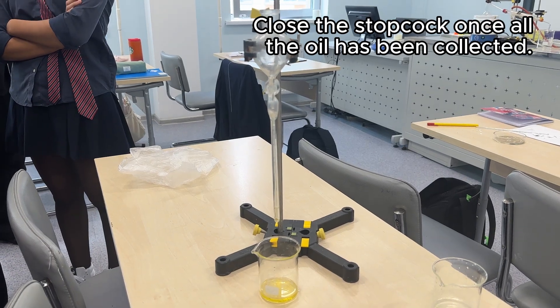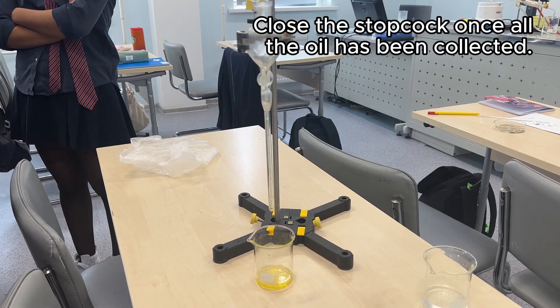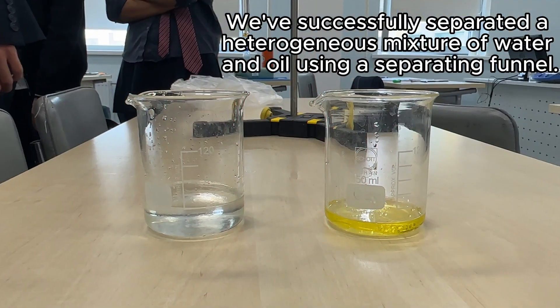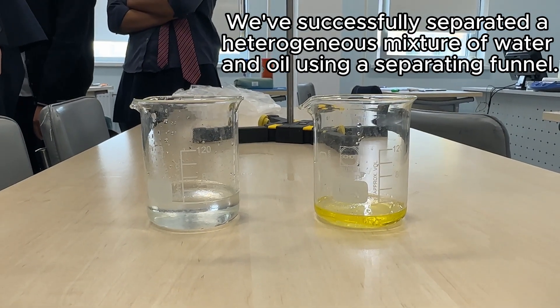Close the stopcock once all the oil has been collected. We've successfully separated a heterogeneous mixture of water and oil using a separating funnel.